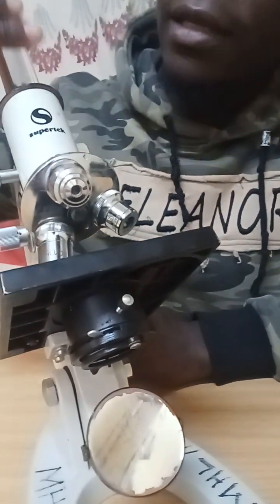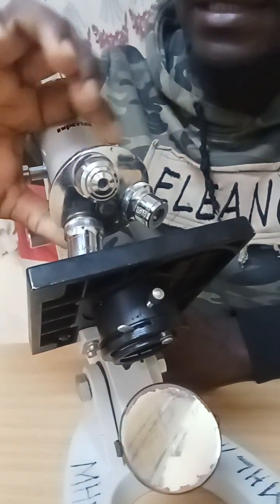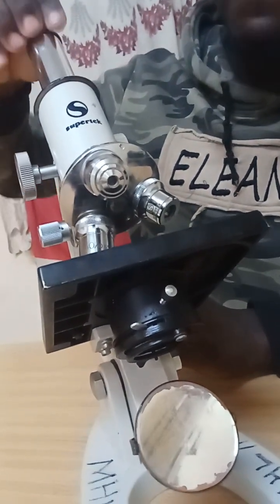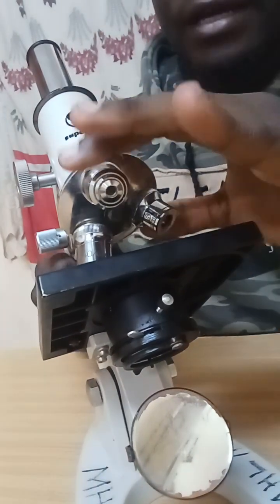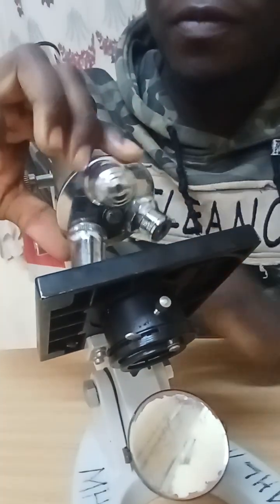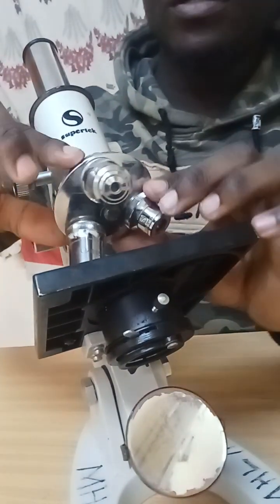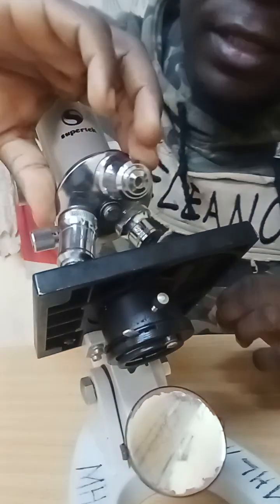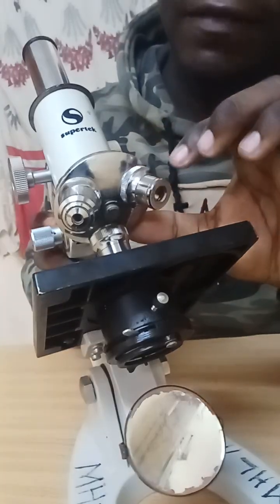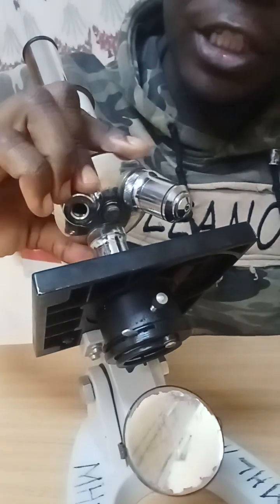Then the next part, we have the body tube. As you can see, the body tube supports these objective lenses plus the revolving nosepiece plus this ocular or the eyepiece lens. Then below the body tube, we have what we call the revolving nosepiece. As you can see, it revolves, and this revolving nosepiece enables change from one objective lens to another objective lens.